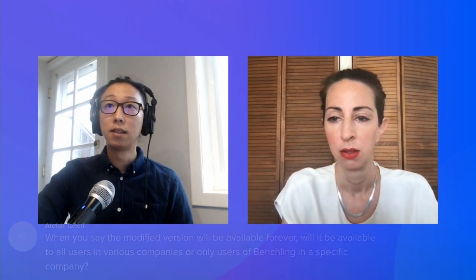Renee asks, where do you identify conjugations such as GalNAc, tocopherol, cholesterol, etc.? Yeah, that's a great question. There's definitely a lot of increase in usage of these different conjugates, such as GalNAc, on some of these oligo entities. The functionality that I showed today was primarily around storing and representing modifications that are on the sequence itself, on the oligo entity itself. Everything that I've shown was primarily on a particular nucleotide.